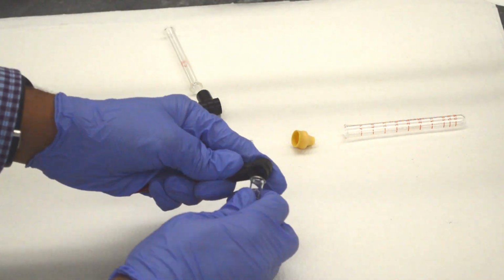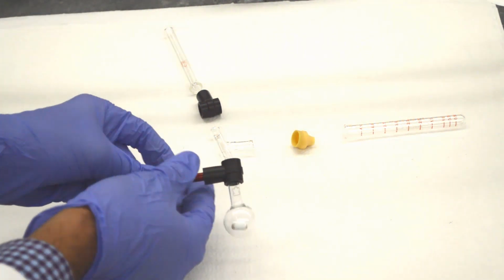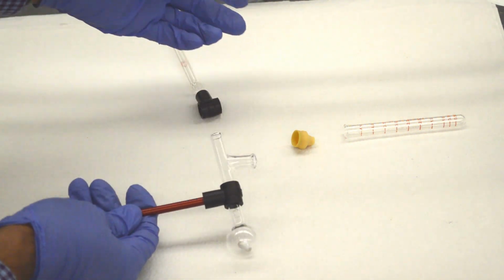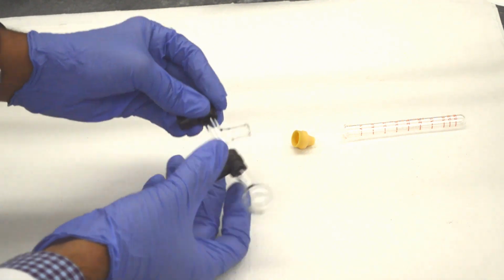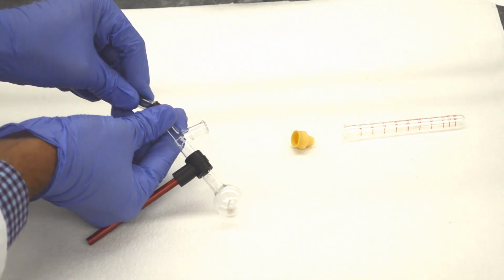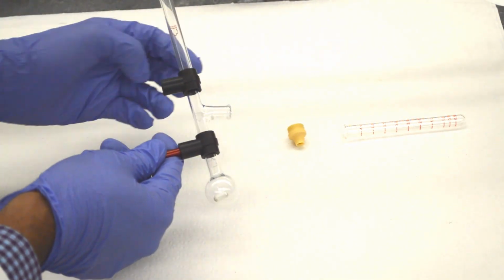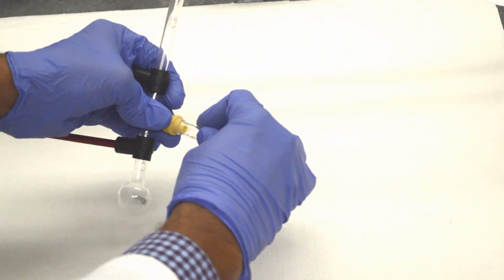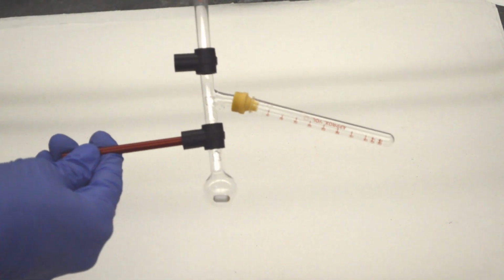Connect the supporting rod. Connect the adapter. And this one is for the air condenser. And finally, put the sleeve and a test tube. Okay. So this is the apparatus we're going to use for today's lab.